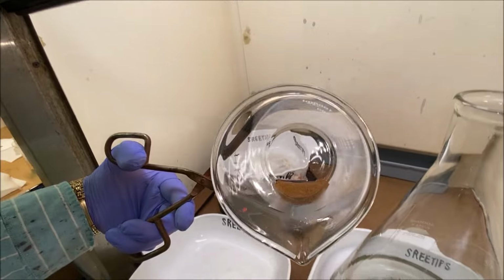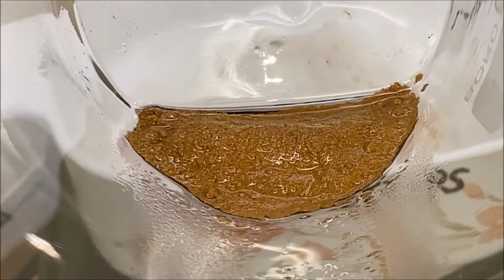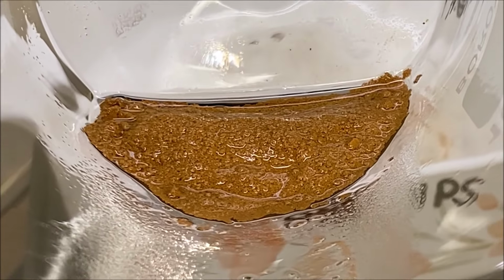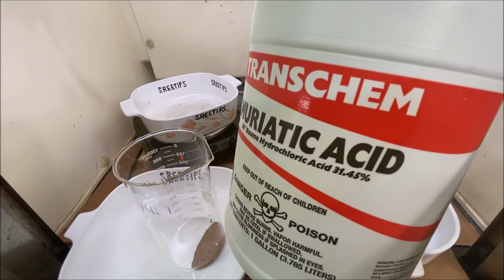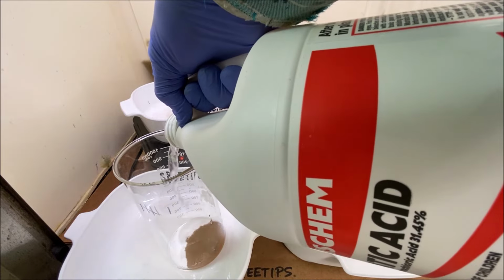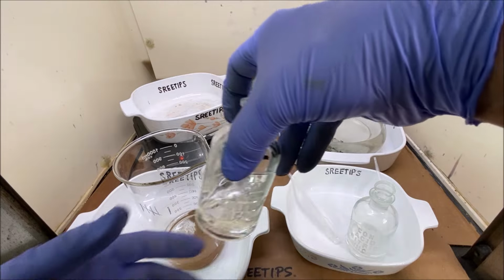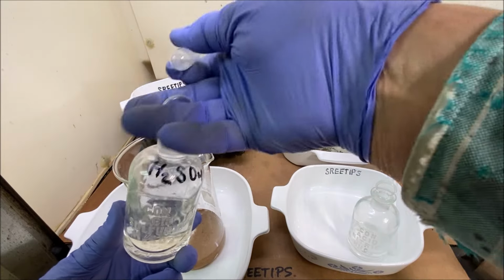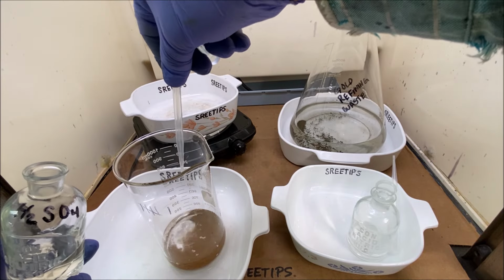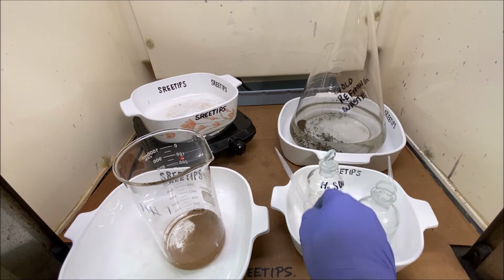Alright, here's what the gold looks like now. Nice, pretty brown gold. I'm adding some hydrochloric acid. Now we're going to add a little bit of sulfuric acid, just to make sure if there's any lead in here that made it this far, we're going to get it out of there.